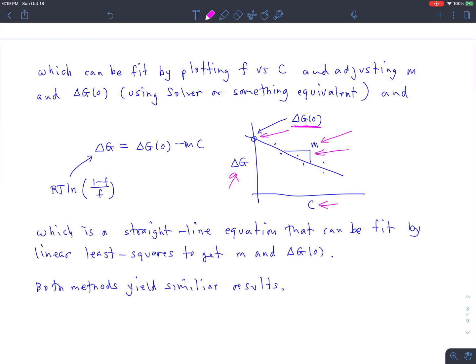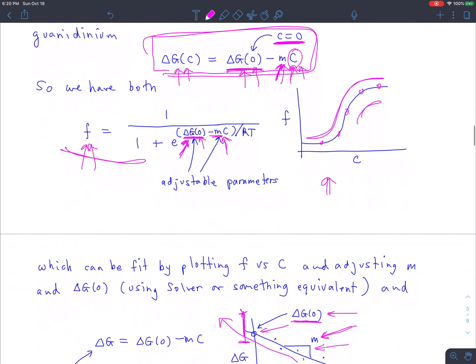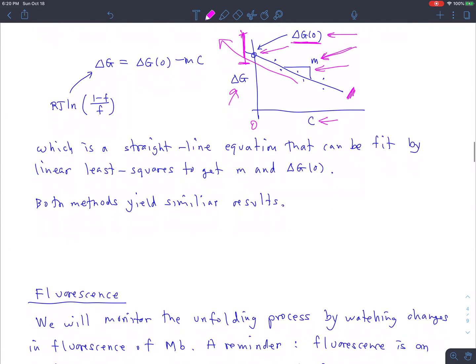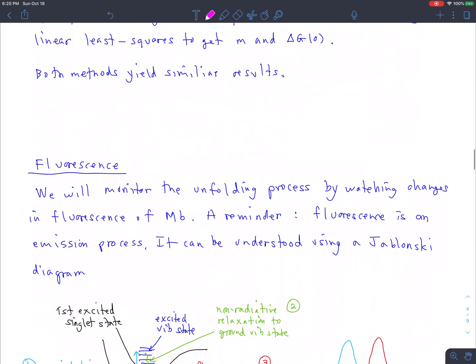Now, when you do things like this, usually the slope is pretty good. Usually the intercept is really bad. And that's because any error in the slope here is amplified and levered out till you get to 0 concentration here, and makes a great big error. It's easy to get a great big error in that intercept. And so I suspect that this method up here will give us better results, but we will see. All right, so two different ways of analyzing the data should give similar results at least. And again, we'll talk about that more next week.